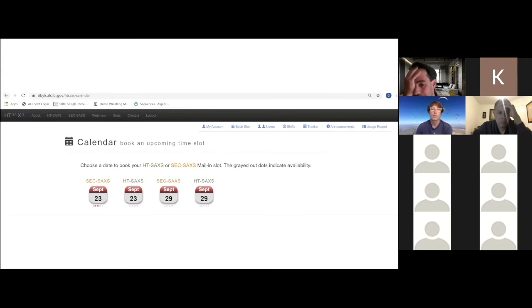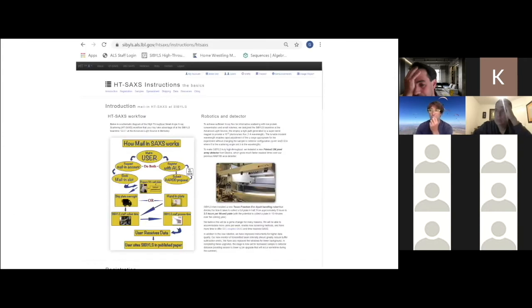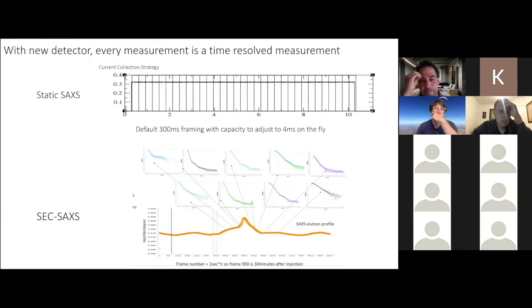All right, some of the things to be aware of with the data. And this was a question from, you know, what happens here. So, Jesse mentioned that there's radiation damage as you expose your sample, and you can never tell ahead of time when that will occur for any given sample. So when we place your sample in front of the beam, as I showed on those needles, we are going to collect about 30 to 50 frames, depending on radiation damage, exposure, etc.